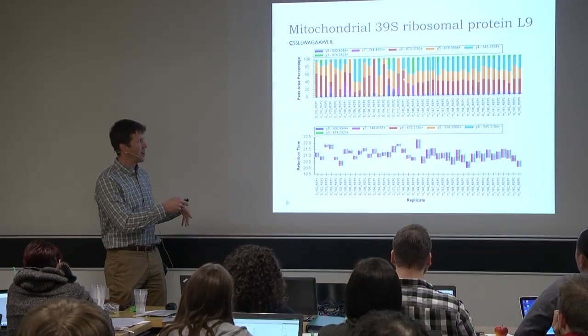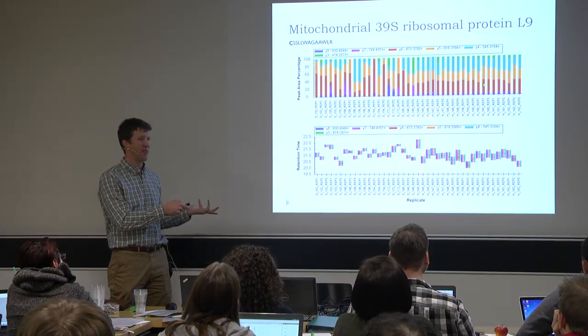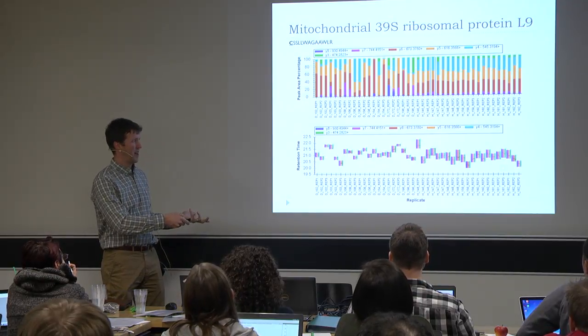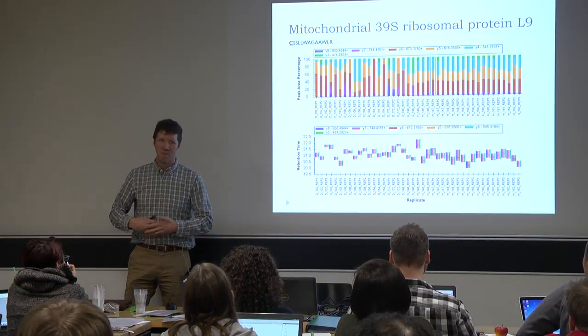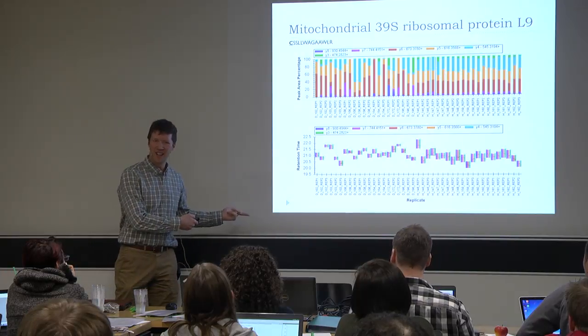But if we looked at the healthy side, it's got a little bit more variance than we saw last time, but it's not terrible. And then the retention time on the healthy side is also reasonably okay. Here it's kind of a mess. So what would you like to do? Can you make a decision yet?